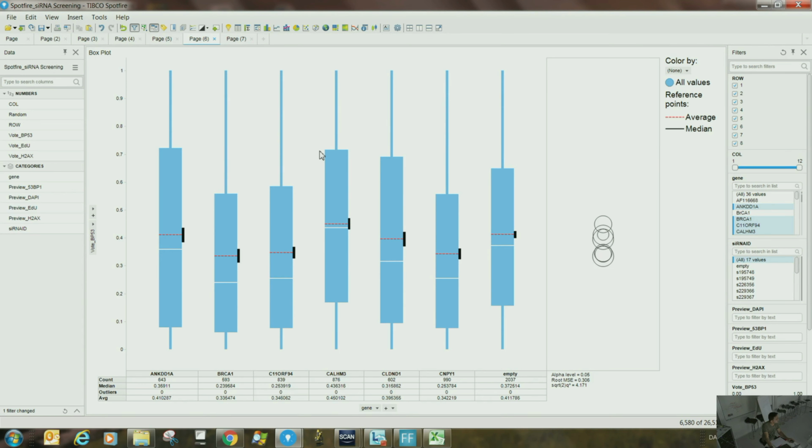So one experiment is 2,000 cells. I know. Yes. It used to be this. They just saw that and then said we need 200 times. You just don't need that. Exactly. I mean, especially those who are working with embryo stuff. Everyone should follow this guideline, right?